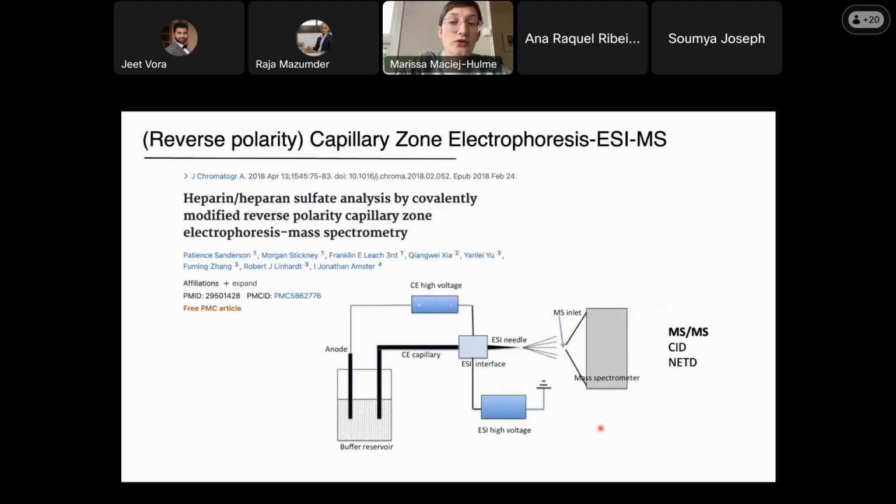So as a postdoc in the Van der Vlag lab in the Netherlands, I was investigating the role of heparan sulphate as a novel biomarker of kidney diseases and became interested in GAGomics as a top-down method to search for potential HS-based biomarkers. The Amster group at UGA in America had developed a mass spectrometry method, one of a few, for HS and heparin using an online capillary zone electrophoresis with a custom-built ESI-MS interface. You can see here an overview of how this would work.